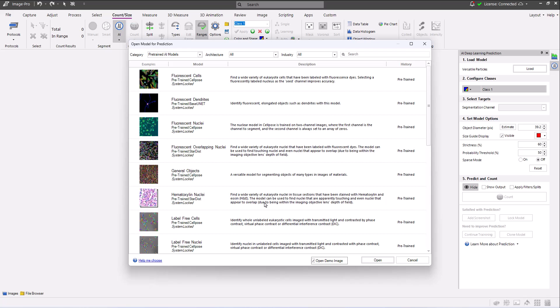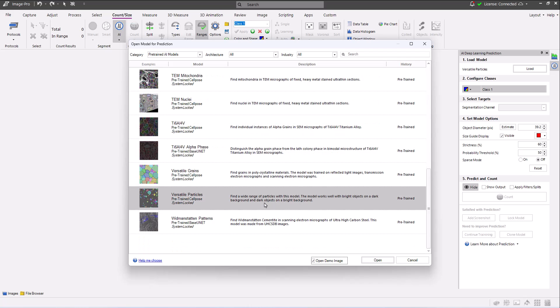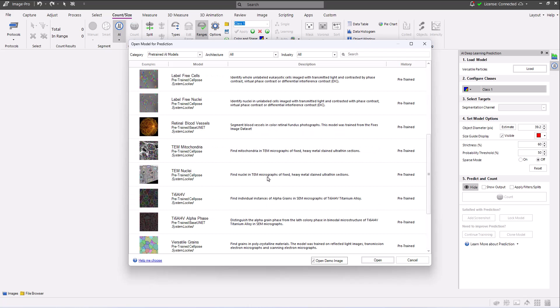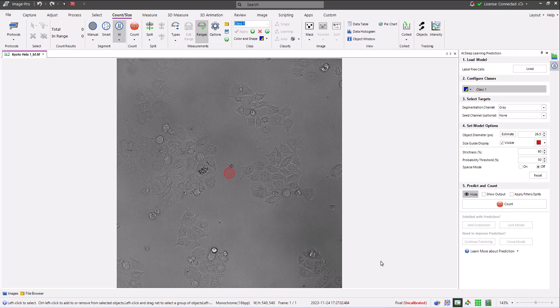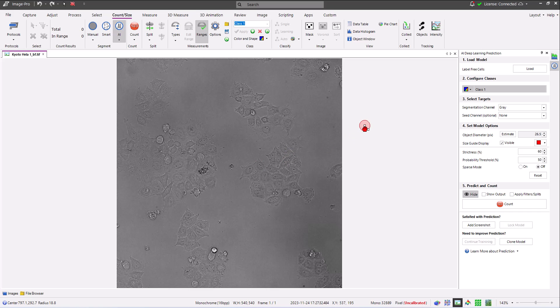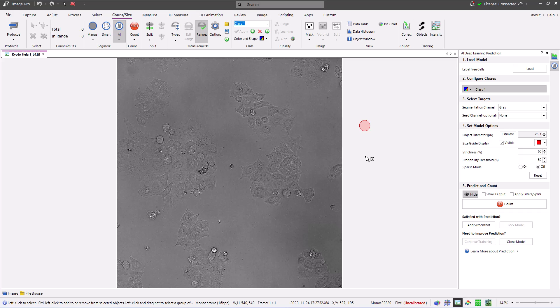I'm first going to load the label-free cells model. The cells shown in the demo image are a really great example of objects that humans can pick out with the benefit of a visual cortex, but that without deep learning were impossible to segment accurately by computers.